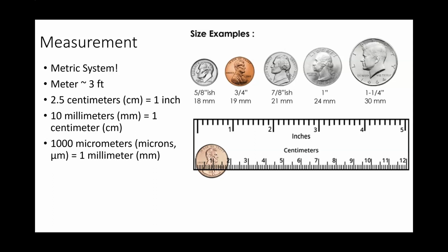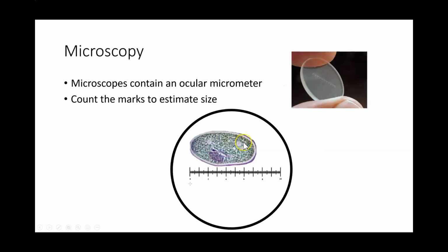A light microscope or a bright field microscope is good at illustrating objects that are in the micrometer or micron range. So how do we do this, right? A ruler's too big. We can't put a ruler in a microscope, or can we? We can, it turns out.